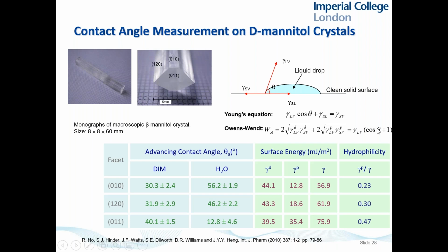You can see here, it's twice as high. And it's twice as high because there are lots of hydroxyl groups on the end of that face, the 011 face. And we'll see in a moment that's important. So this is a very hydrophilic face, and the other ones aren't.